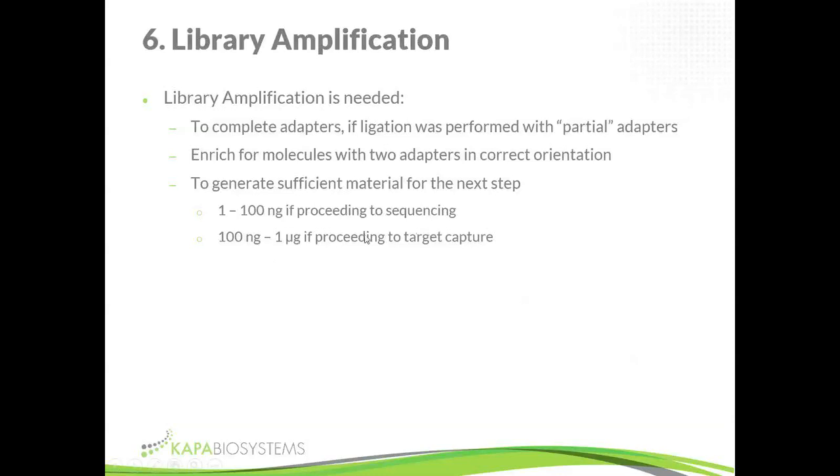And so that impacts how much you can start with, and whether or not you do size selection, because the aim always is to do as little library amplification as possible. Because even with good enzymes like the Kapa HiFi enzyme, every cycle of library amplification does increase the risk of introducing substitutions and all kinds of other artifacts.